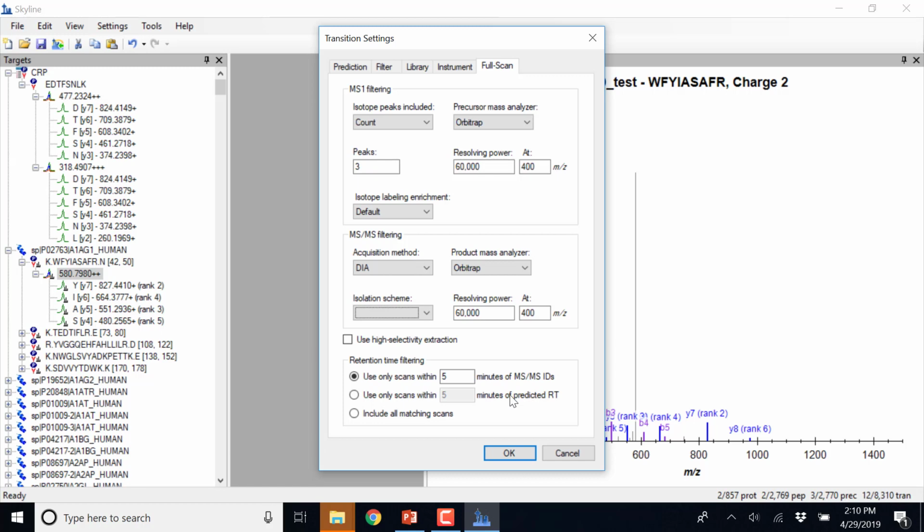That's a double-edged sword, because the way you look at full scan data with Skyline is you'll have better confidence in identifying the proper peptide the more co-eluting isotope peaks there are, right? So if you just say, show me 1, you're going to have 1 color extracted ion chromatogram with tons of peaks, and Skyline's only going to pick the tallest. And as we know, the tallest is not always right.